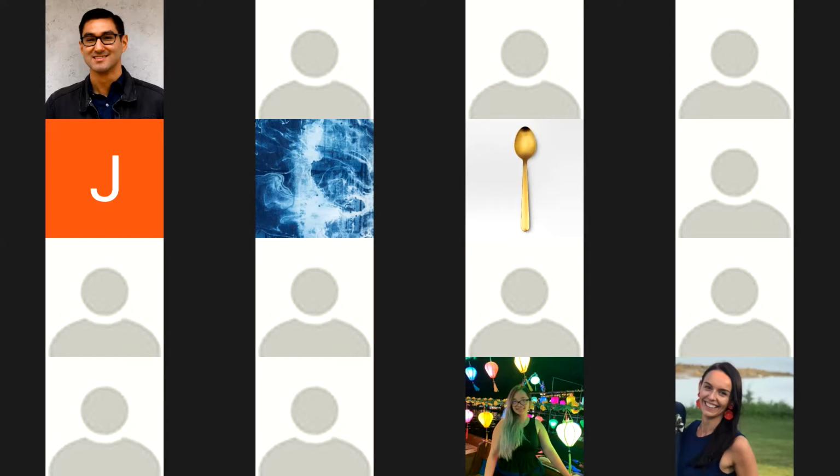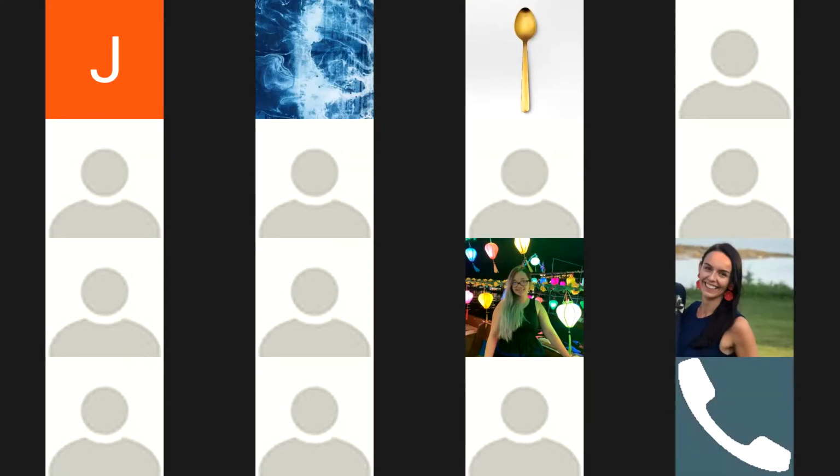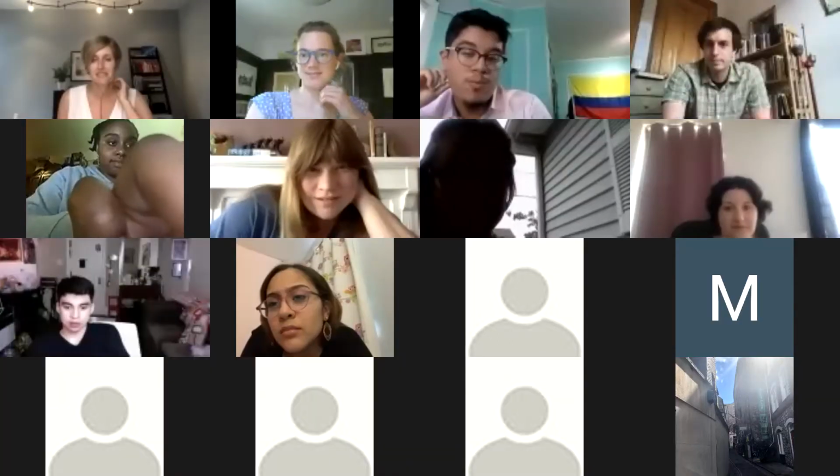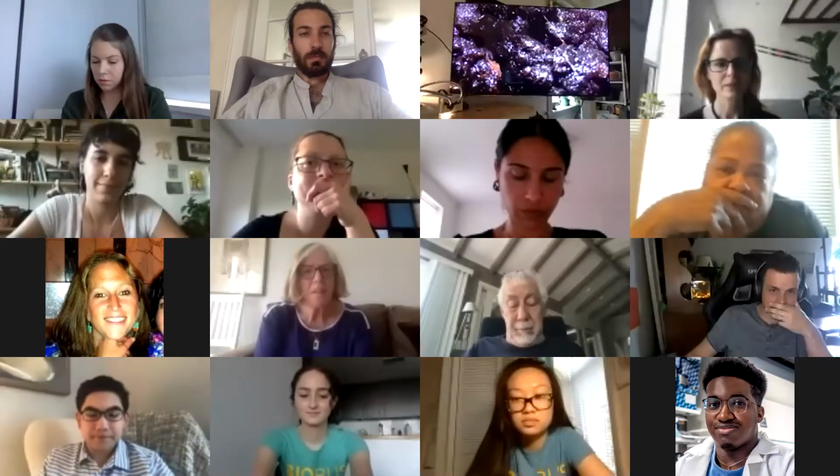I'm going to use the top-down light on here so that we can see all of this yummy organic matter. Okay, whoa, there's a guy already. Oh, he hid right under that leaf. Okay, so let's just look around and see what we notice. I noticed that it is a little bit blurry. So here I can see some chunks of soil sitting here.